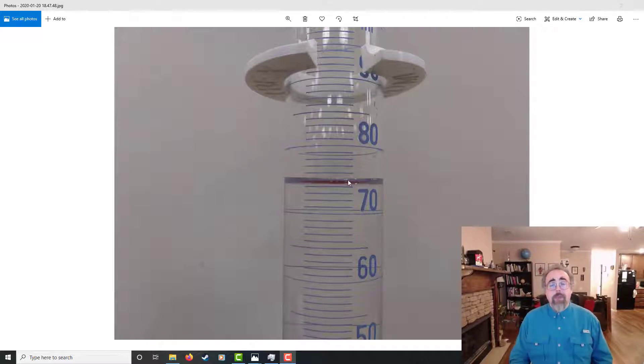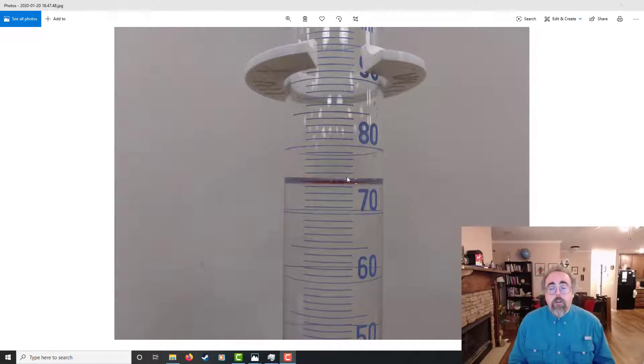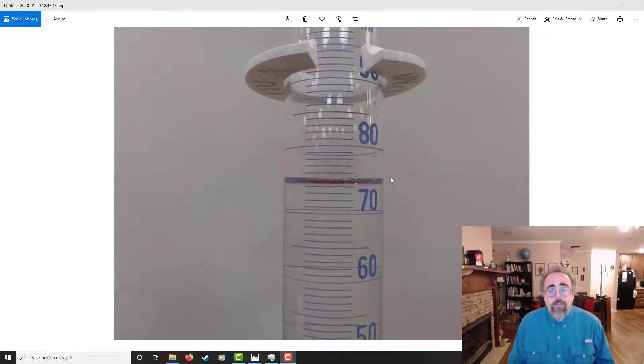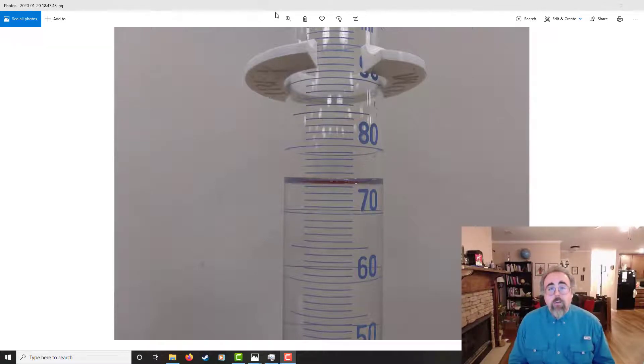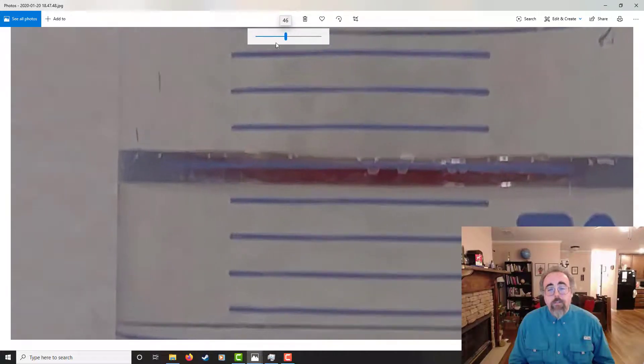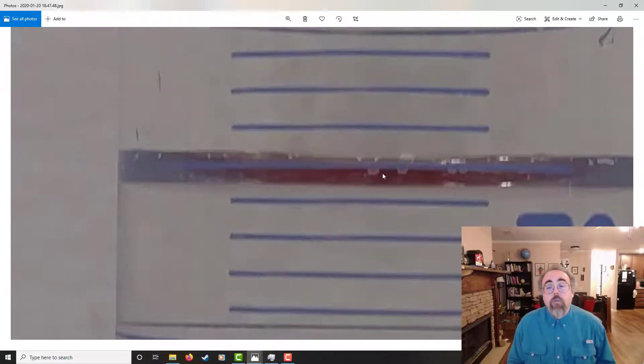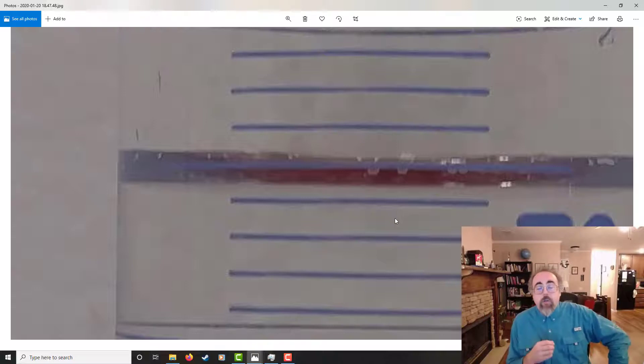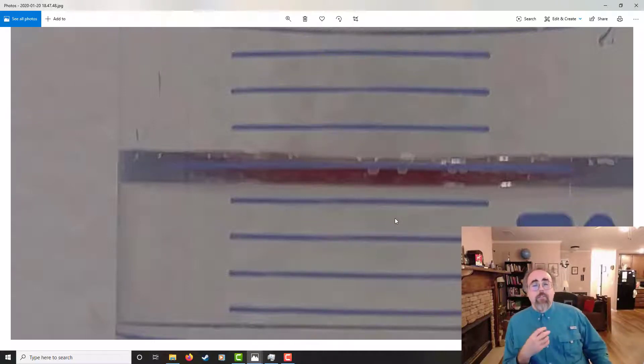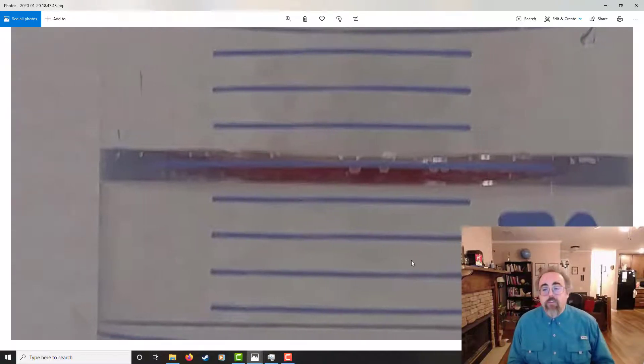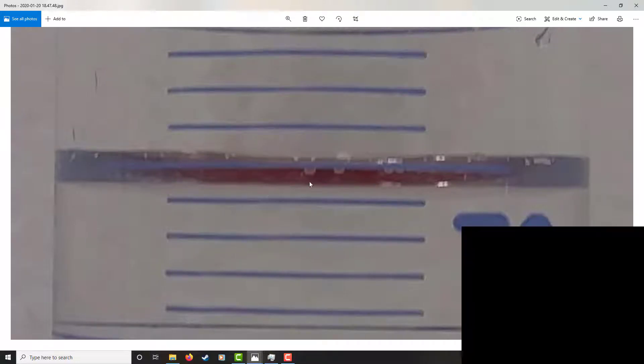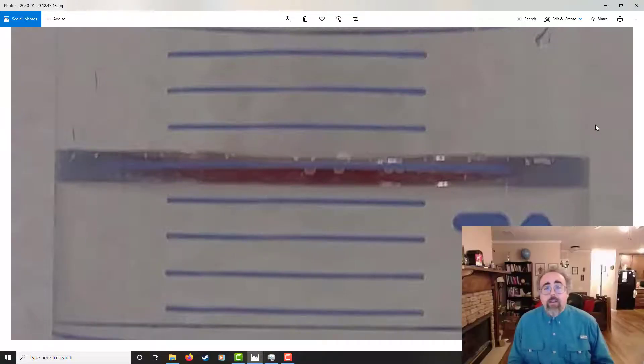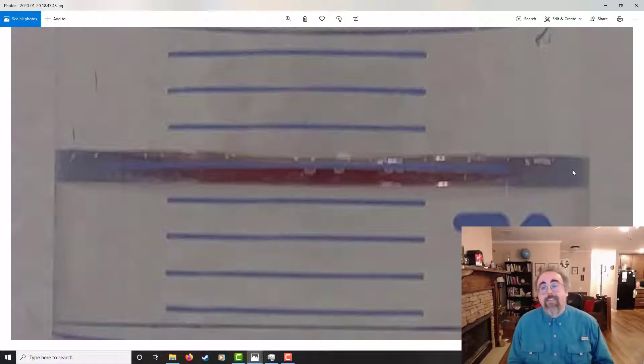Okay, so I've got my camera and I've made sure it was nice and level with the air water interface. The reason I did that is because it's actually a three-dimensional thing and I don't want any weird parallax issues. So I'm going to level that out. And I want to zoom in and get a good view of this.